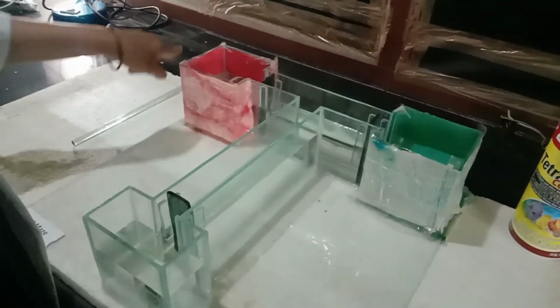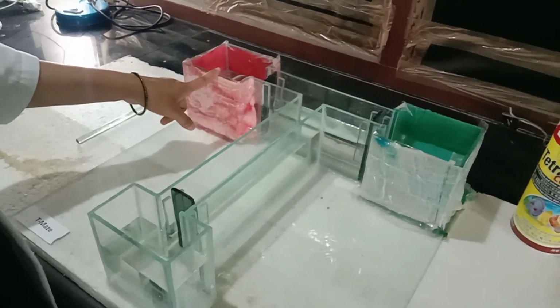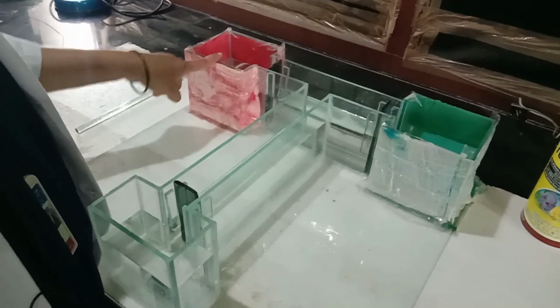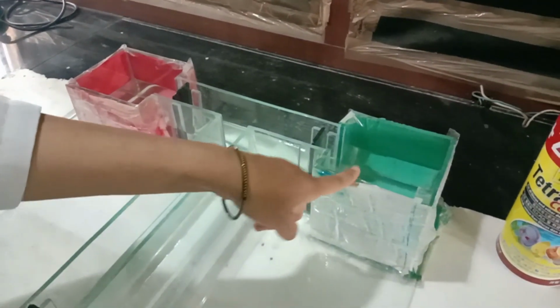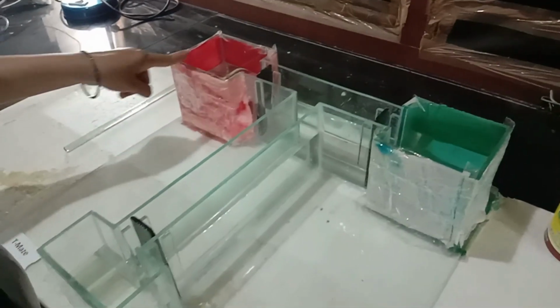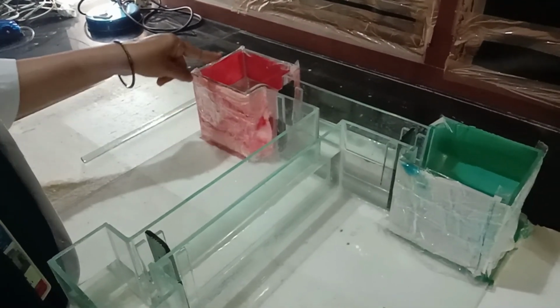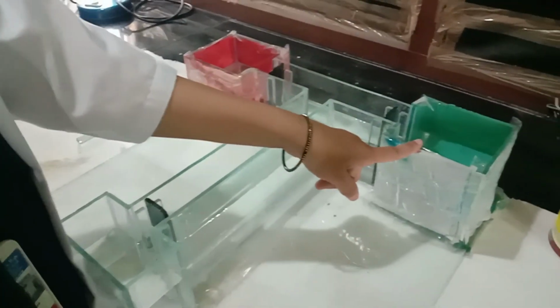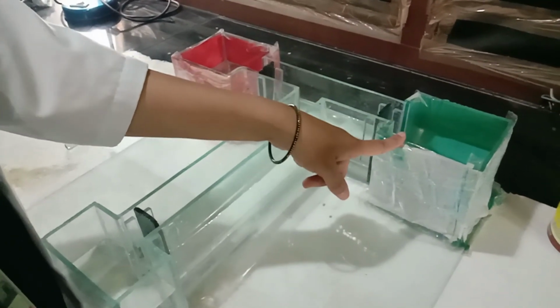And why did we cover these 2 zones with different colors? Because zebrafish can easily distinguish between colors. So we covered the unfavorable zone with red color, that is a sign of danger, and this green color, that is a favorable zone. In the unfavorable zone, we disturb the zebrafish with a glass rod or we chase the zebrafish with a net. In the favorable zone, we provide feed or we do not disturb the zebrafish.